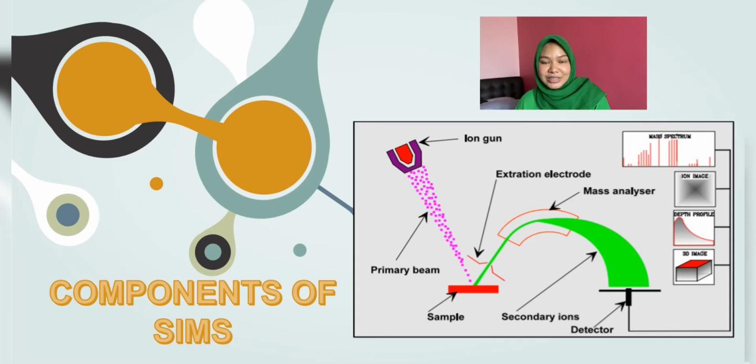Most SIMS instruments used for elemental and isotope analysis function by accelerating ions produced in the source along a potential gradient, typically 10 kV, and then transferring these ions into the mass spectrometer. Details of the configuration of the mass spectrometer vary from one application to another, but all utilize both magnetic and electrostatic analyzers, commonly referred to as sectors.